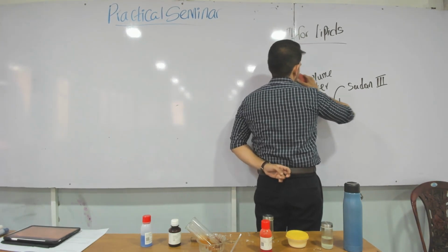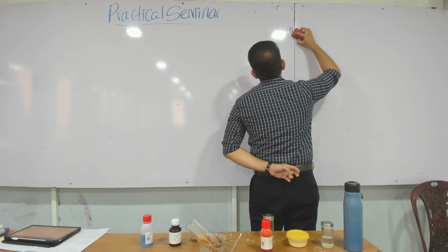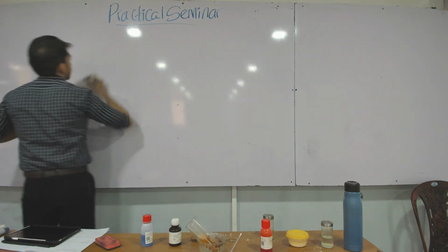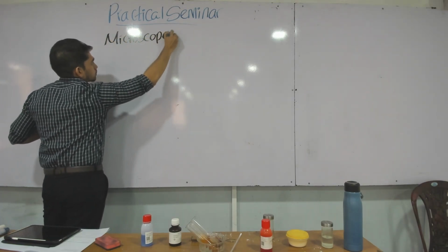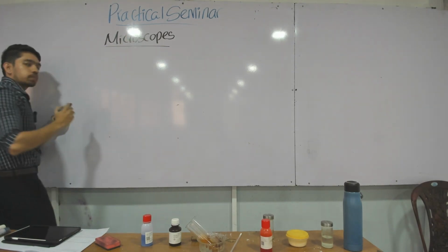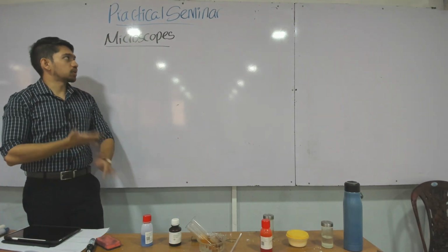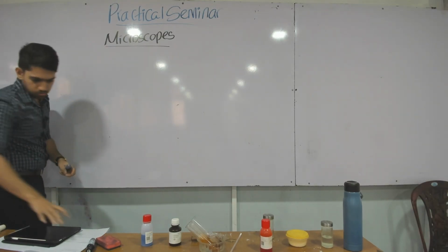Just like when buying a car you look at the engine capacity, in a microscope the magnification power is a fundamental property. There's another property called resolution power that we'll talk about. So microscopes, we have two main types to discuss. Before that, any microscope has three features. Mainly this relates to light microscopes, but anyway, let's do a classification first.